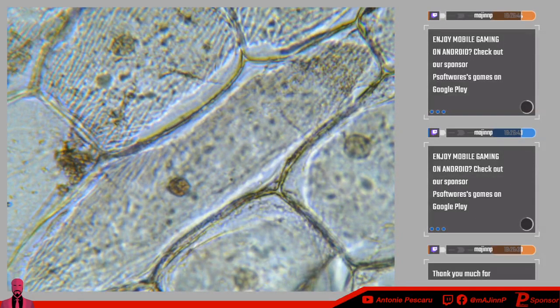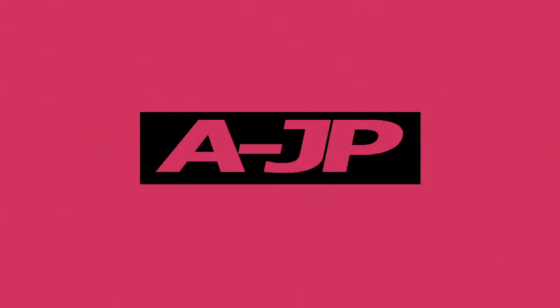To me personally, what I enjoyed most looking at was perhaps the buccal cell. And there's not a lot of time left, so I am going to stop that sharing and go back, and we're going to take a look at the buccal cell.